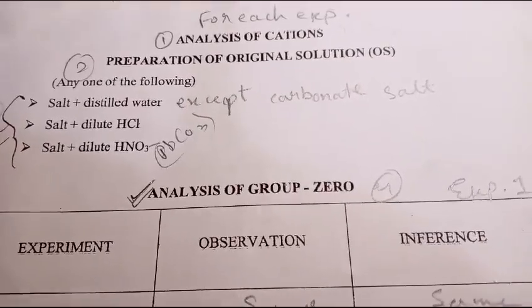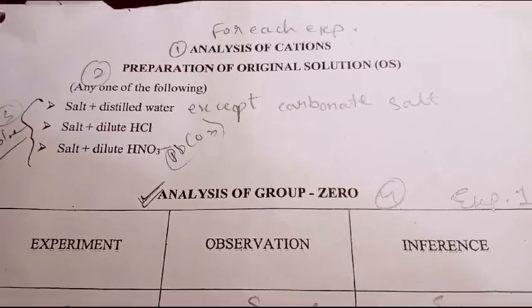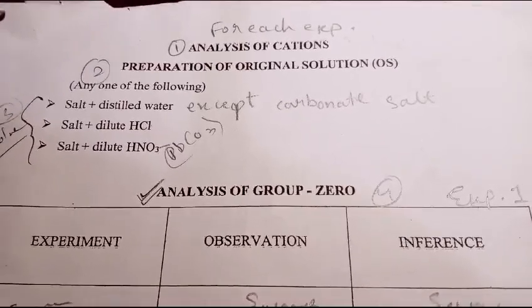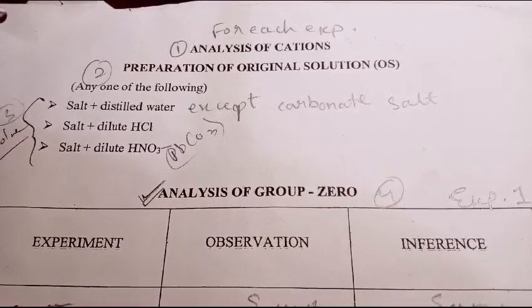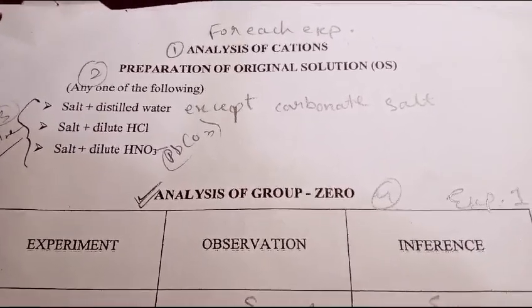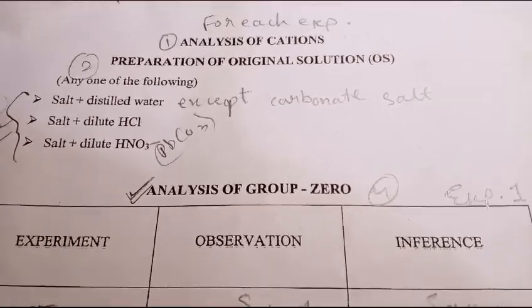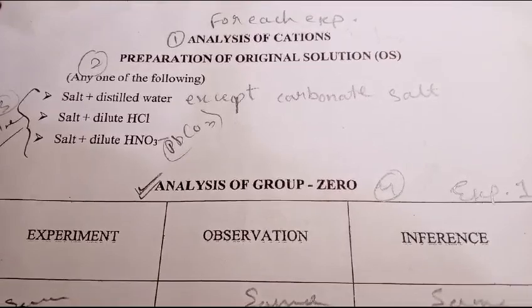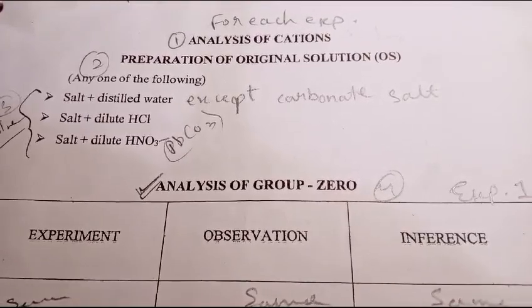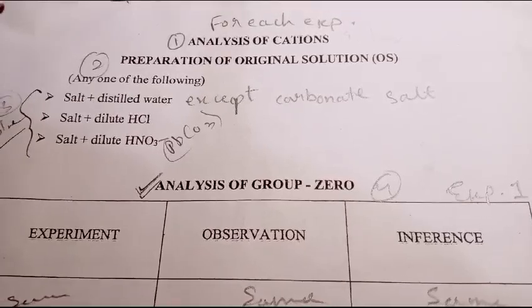As I told you before, we will do the cations first. We have to prepare the original solution. Take a test tube, add salt and distilled water. If it dissolves, then it's okay. If it doesn't, then proceed. Further, you will take 1 spatula of salt or 2 spatulas of salt.